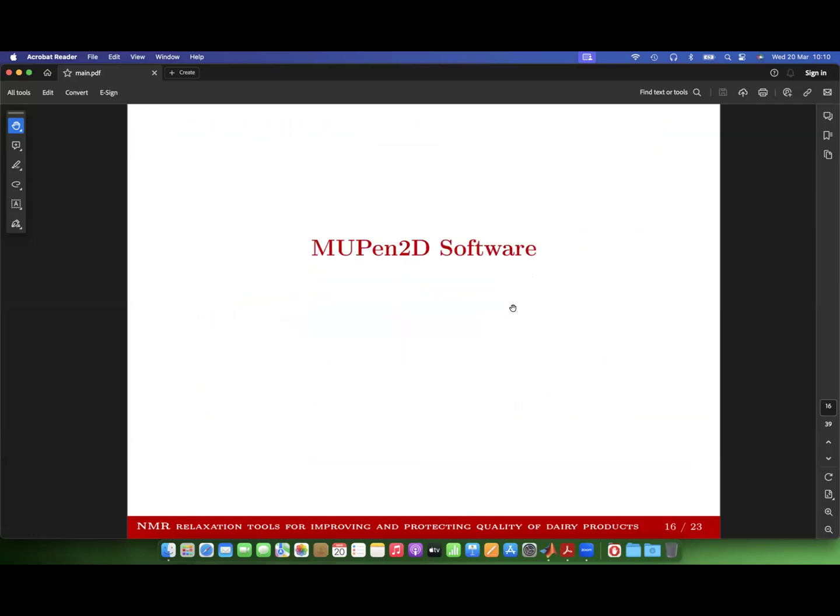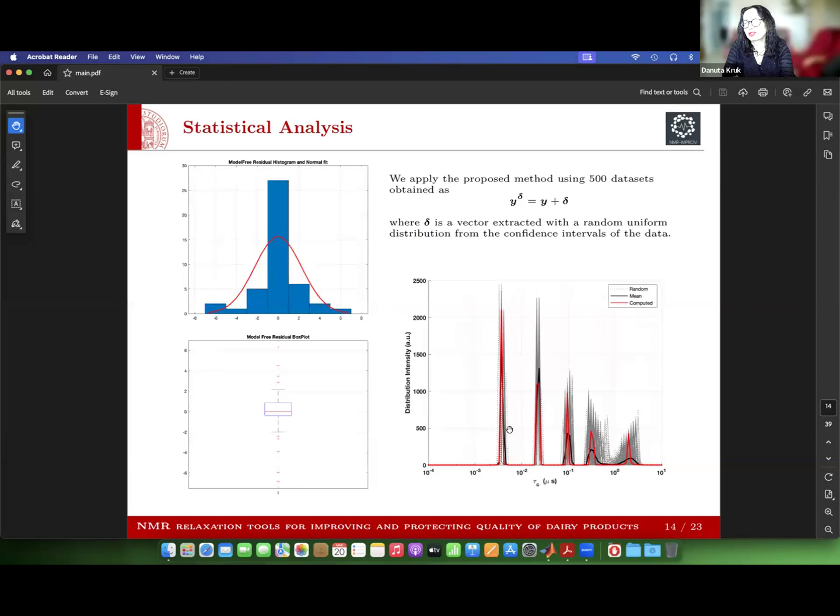You are referring to this kind of repetition. Yes. Okay. May I just be more precise? If we try to make an analysis of the same data, but not using the concept of the distribution of correlation times, probably we will be driven to a solution which would have maybe the same number of correlation times, but not in the form of a distribution, but in the form of some discrete number of values with some uncertainty on them. So my question is, can we look at this distribution and think of the width of these peaks as the uncertainty of those central values of those peaks?